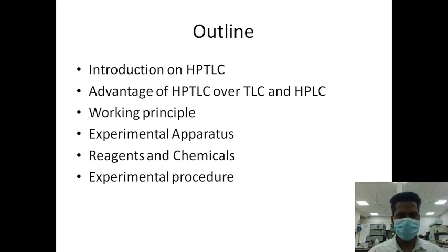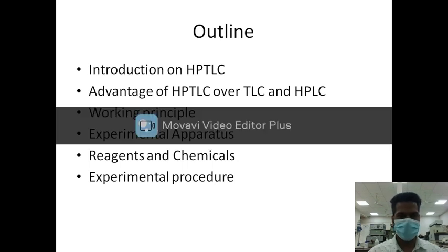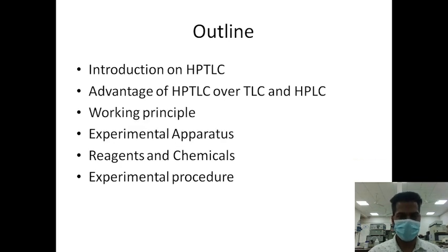First, I will give an introduction on HPTLC. Then I will talk about various advantages of HPTLC over TLC and HPLC. Then I will talk about the working principle of HPTLC, then experimental apparatus and reagent chemicals used in HPTLC, and finally I will discuss the experimental procedure.